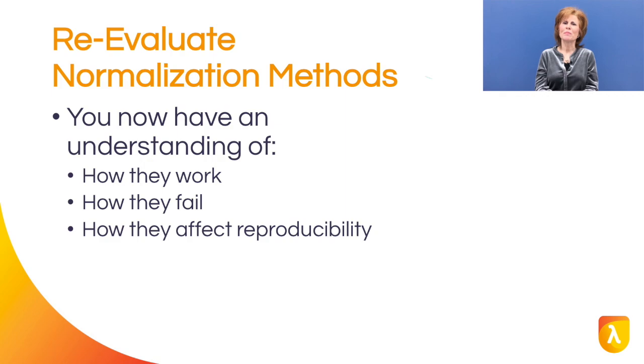As scientific publishers look more closely at experimental methods and data analysis, it presents an important opportunity to re-evaluate commonly used normalization methods. We have talked about the different strategies to better understand how they work, how they can fail, and how they affect reproducibility.